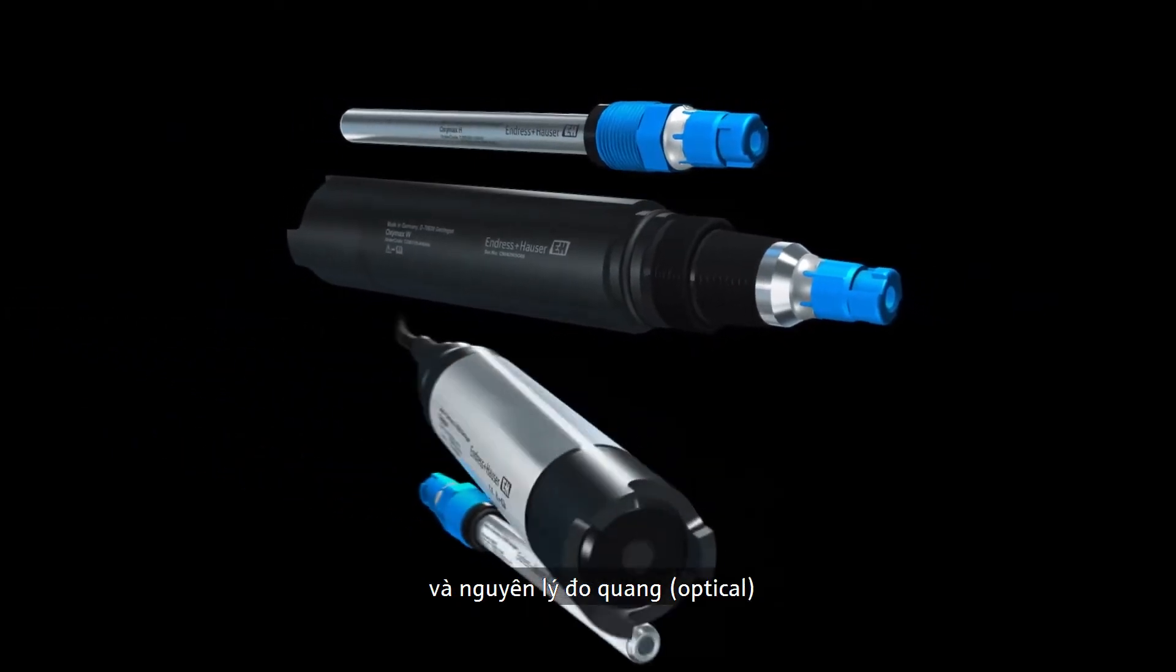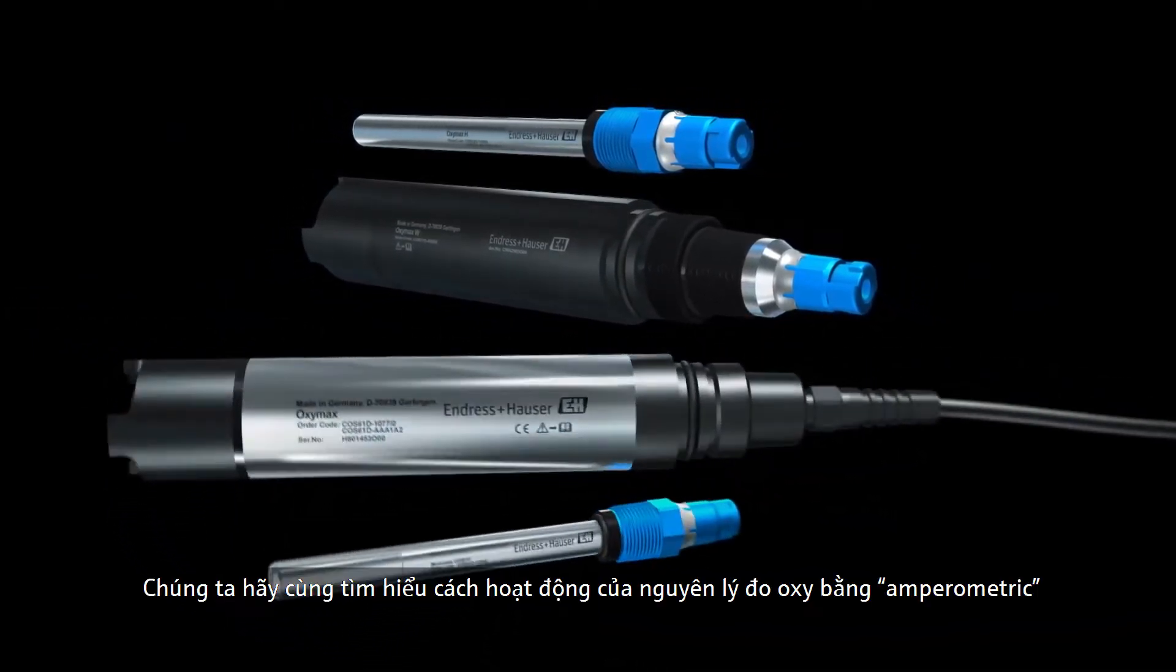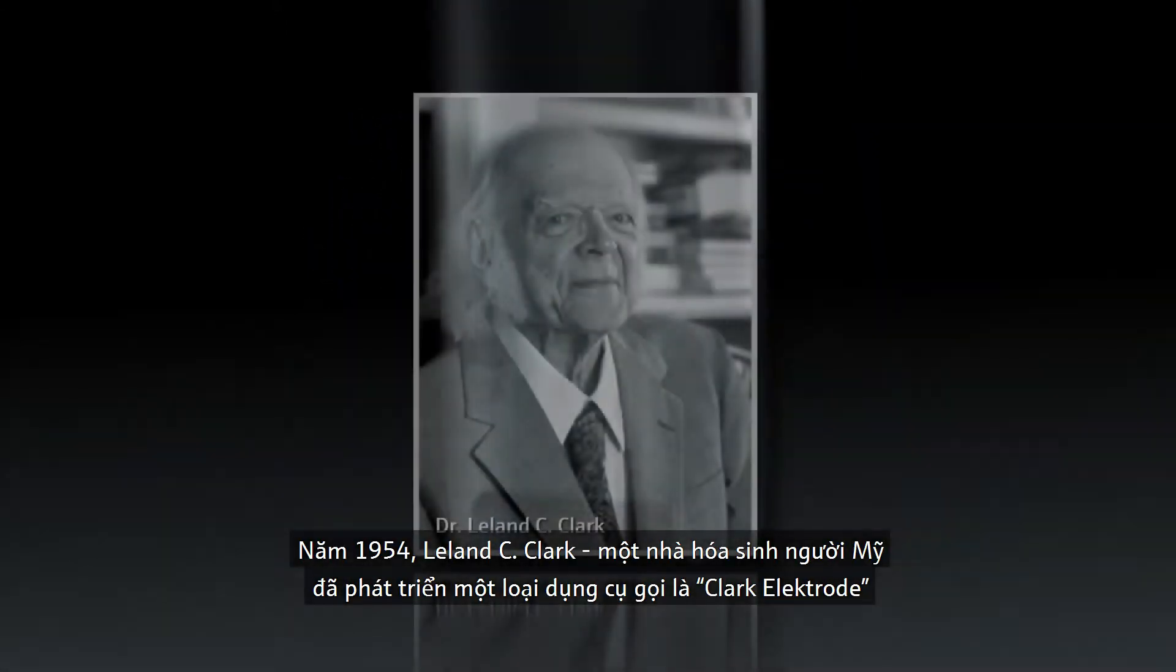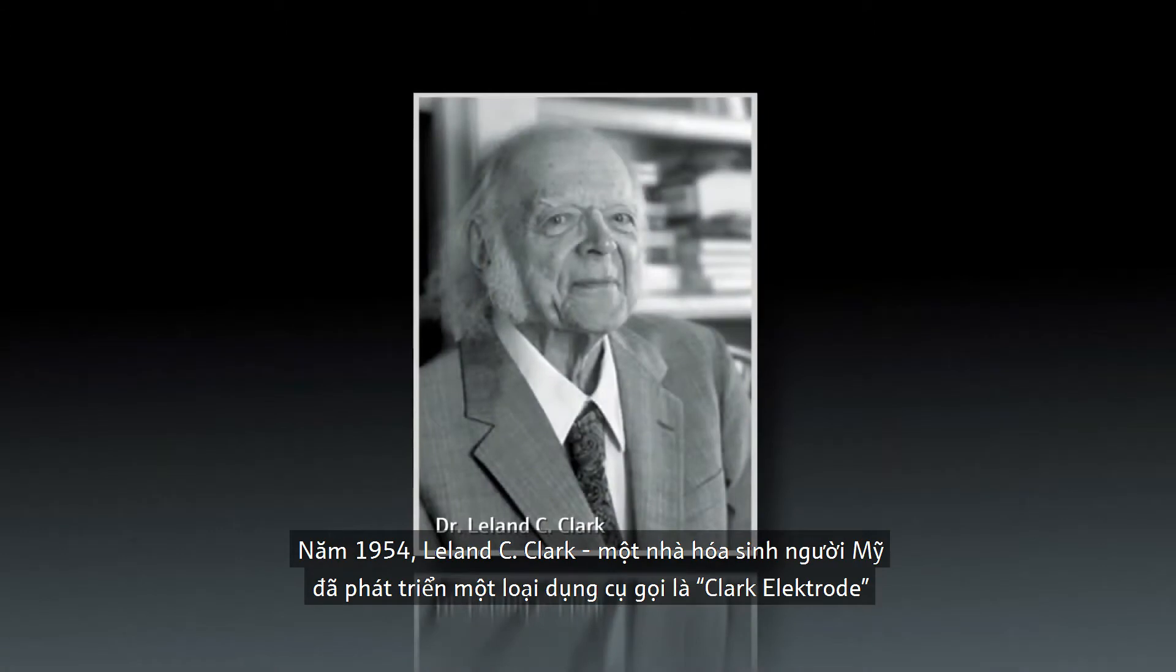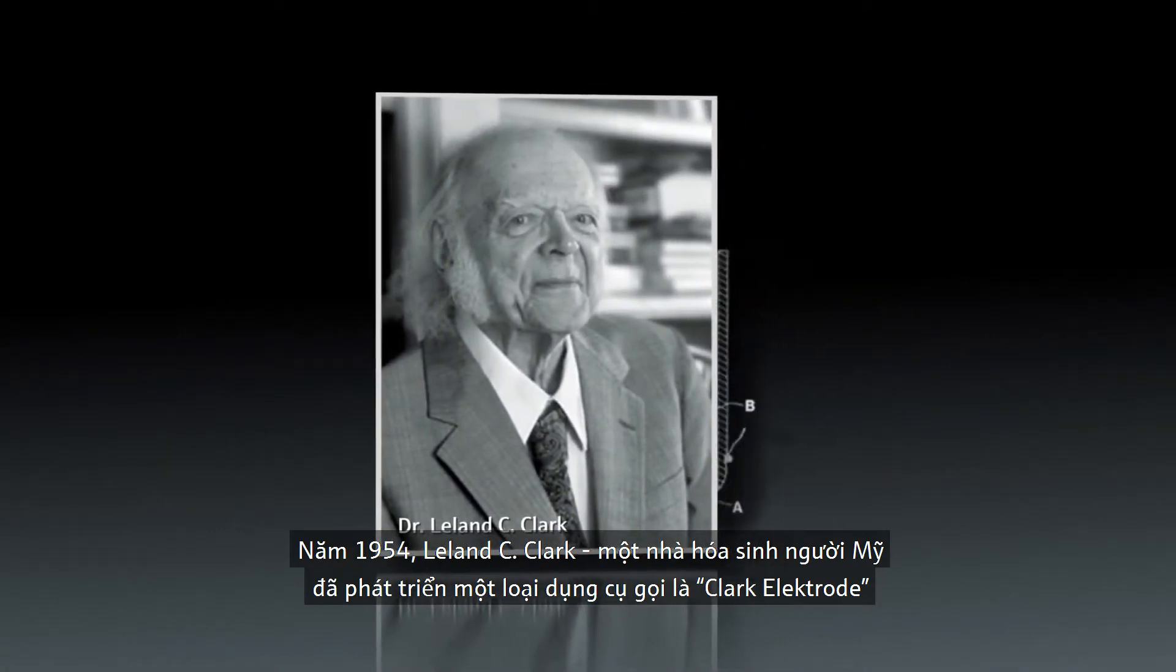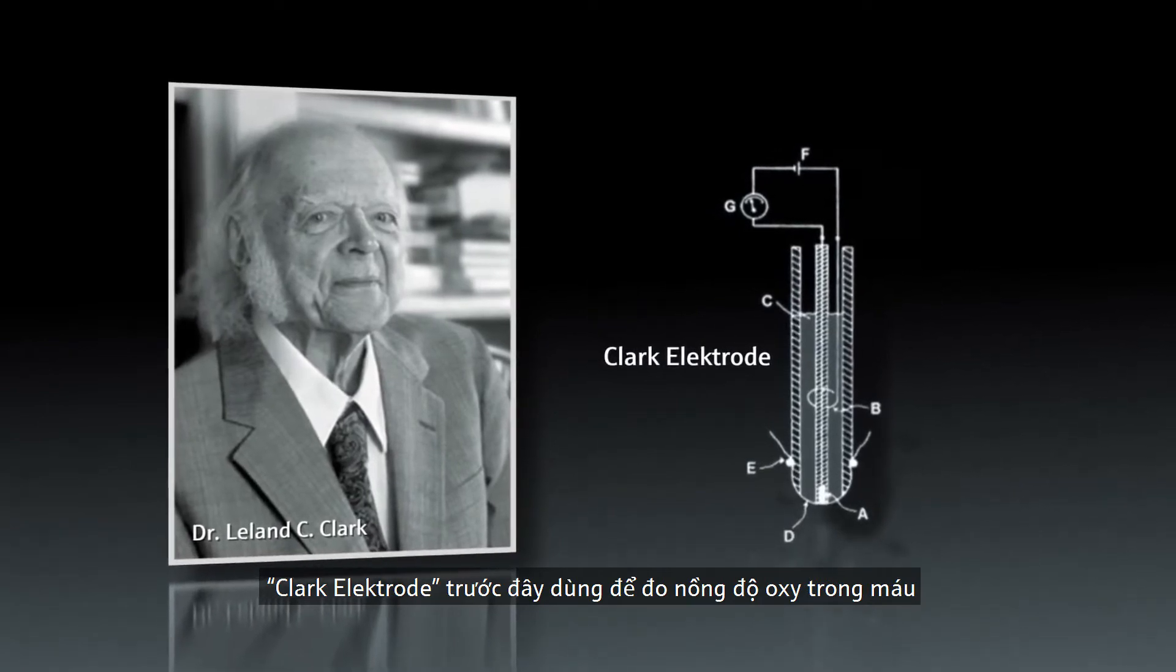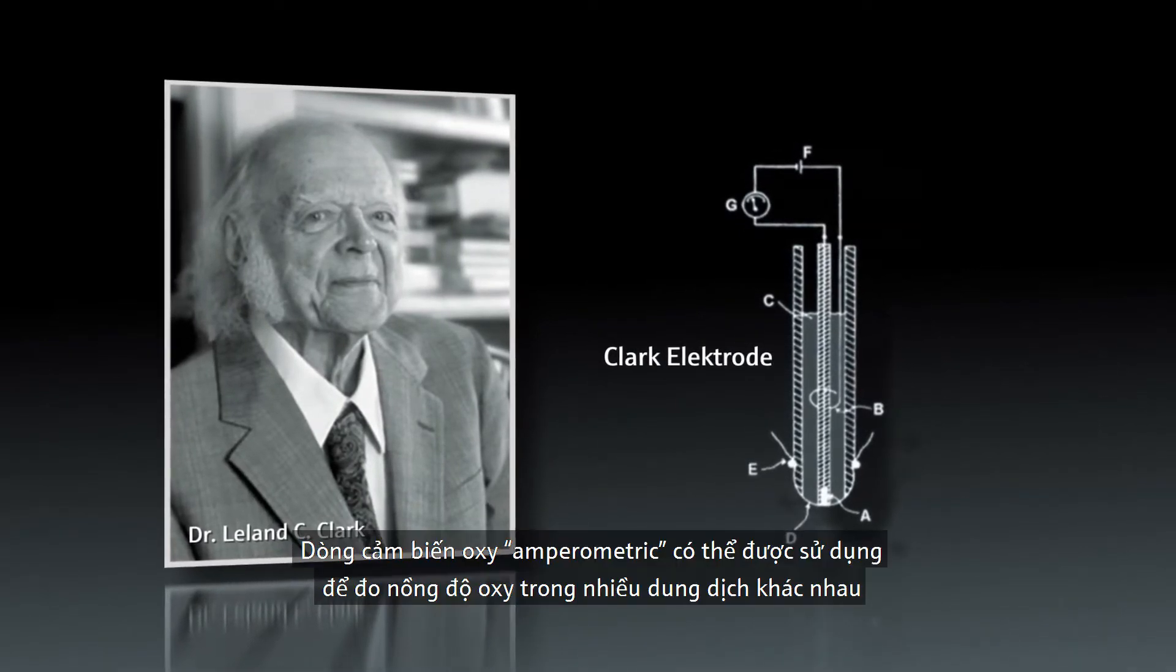Let's take a look at how the amperometric oxygen measuring principle works. In 1954, Leland C. Clark, an American biochemist, developed the so-called Clark electrode to measure the oxygen concentration in blood. This type of amperometric oxygen sensor can be used to measure the oxygen concentration in many different solutions.